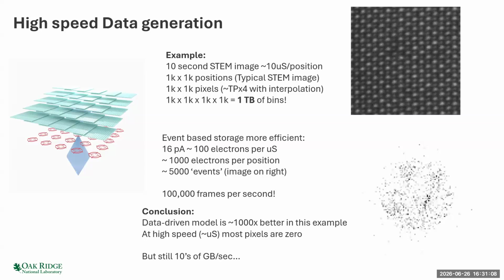But there are some compression games you can play. The important point is this is tens of gigabytes of data that are arriving in a second or so. I should say we have a machine which has 500 gigs of RAM, and I managed to make that crash a few times by running out of memory.